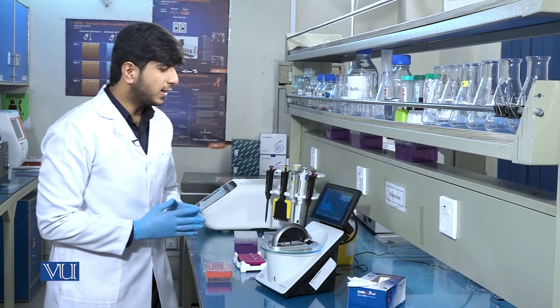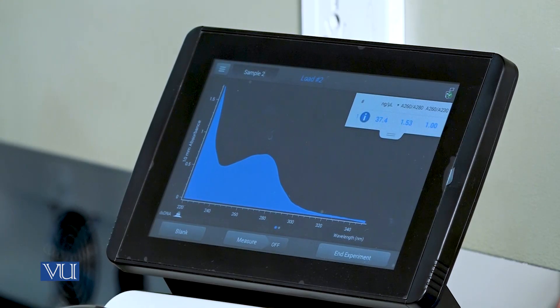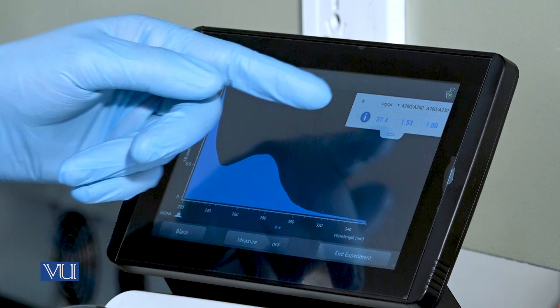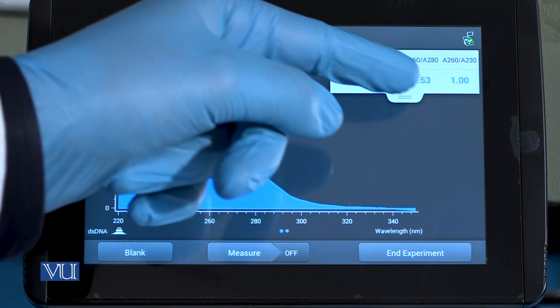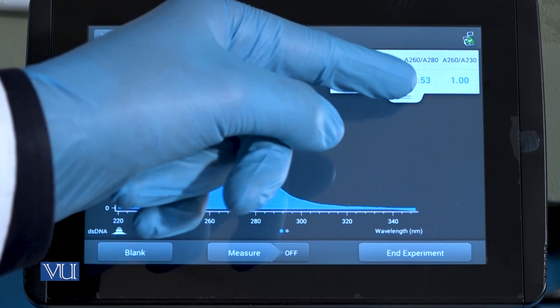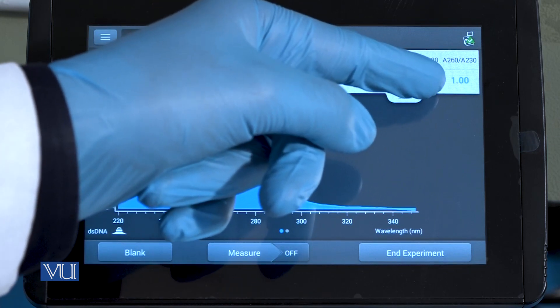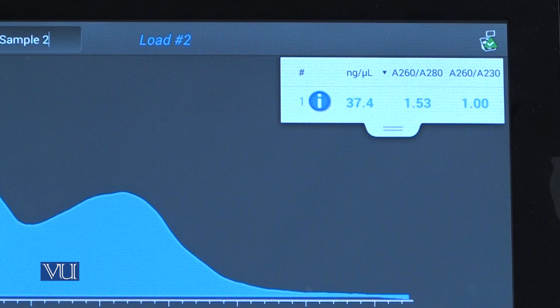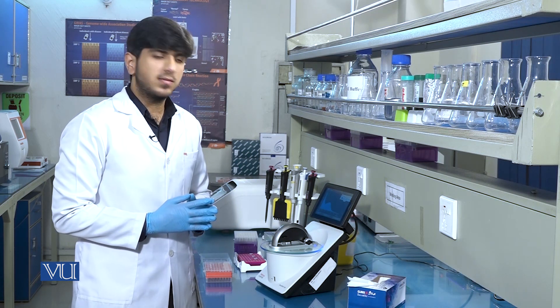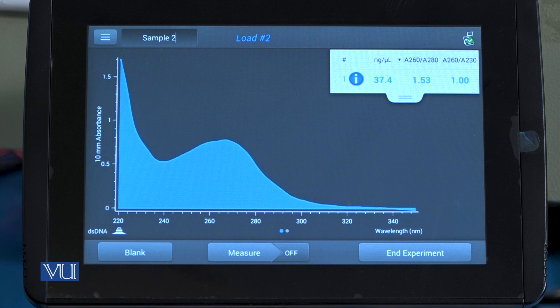Here you can see the result. There are three values reported: nanogram per microliter, which is the concentration of DNA; A260/280, which gives the purity of the DNA; and A260/230, which also tells us about contamination present in the sample. In this sample, the concentration of DNA is 37.4 nanogram per microliter, and the purity of the DNA is about 1.53.